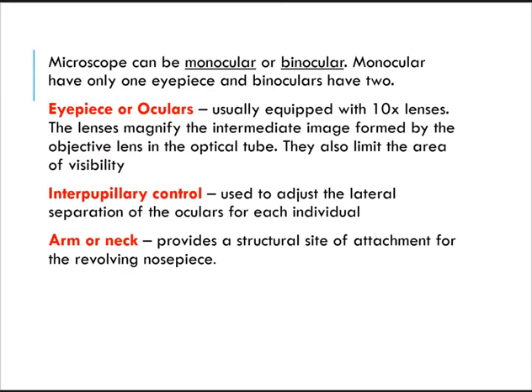Take note, binocular is usually used to allow viewing with both eyes, and it results in less eye strain.